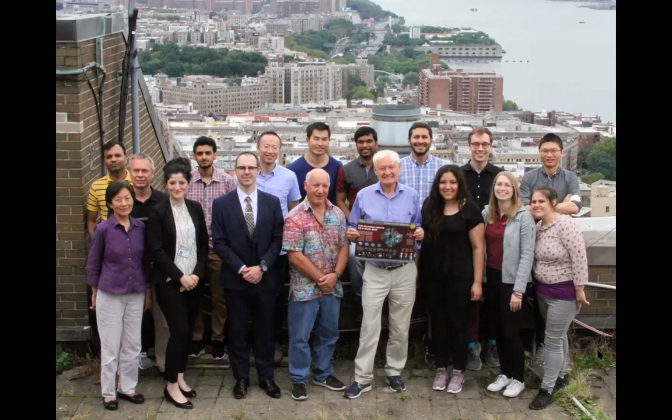There is a question from Manjunath Javur. How do you approach solving a protein structure which is dynamic and also has no initial model available? Do I understand it right? A protein structure that is dynamic? Well, this you more or less addressed, but how do you generate initial models? The question is the initial models.